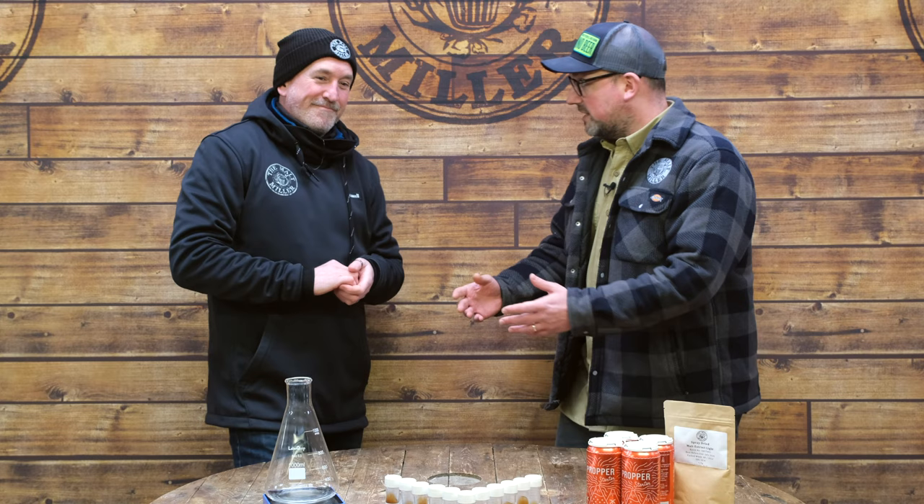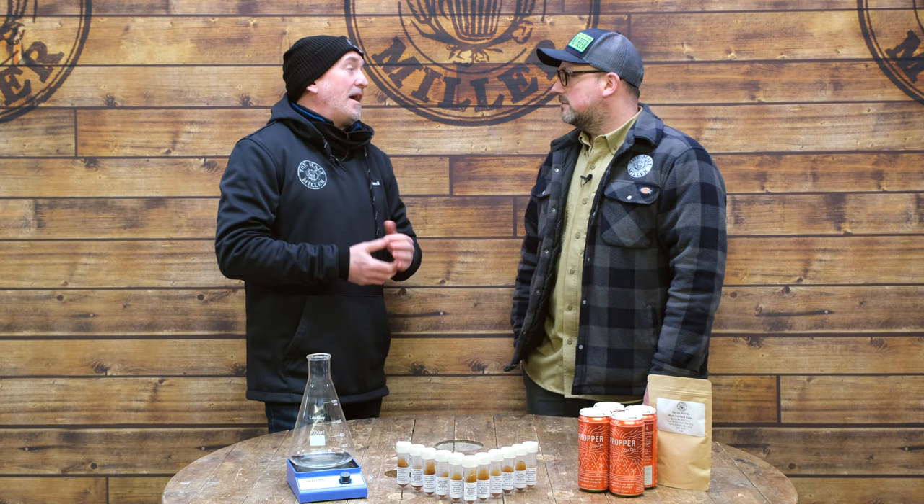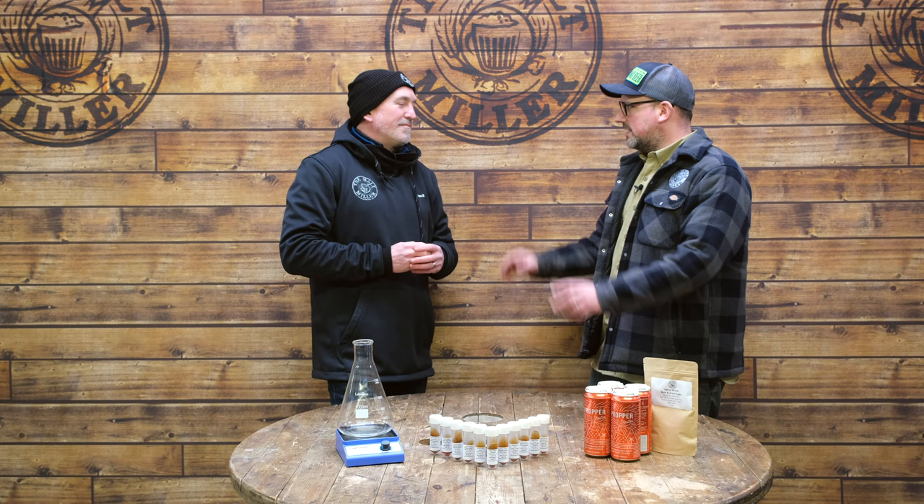The idea is that we grow the yeast in a tiny amount of wort, then top it up and keep growing the yeast. While this is a little more involved than just opening a packet of dry yeast, it gives loads more flexibility and it isn't particularly challenging. It gives the brewer way more control over their pitching rates, which is exactly what we're trying to achieve. We will be shipping every one of these yeast slopes with full instructions. Basically, we make a malt extract solution, wash the yeast cells off the agar they're housed on, and grow that into a bigger volume.